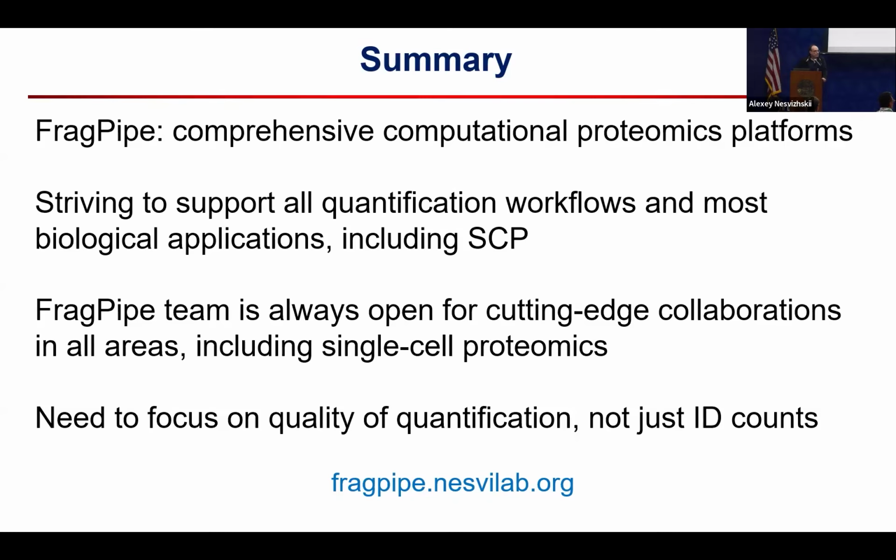And we usually throw away the contaminated signal, but there is another possibility, which is maybe we can try to estimate that interference because we measure both the source from which it's likely to have come or potential sources, and we measure the ions that have been interfered with. Do you think it is practically feasible to think of ways to model that and at least partially diminish the effect of that interference? So it's a good suggestion, an interesting idea to pursue.